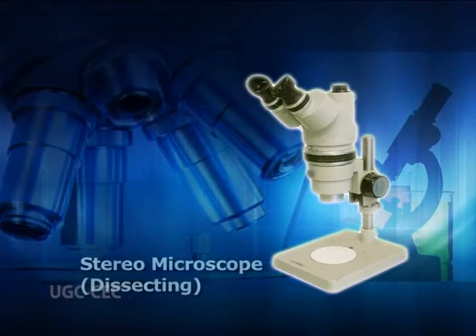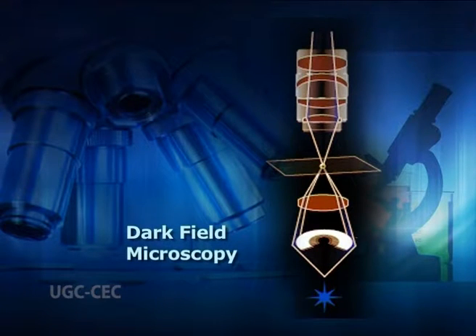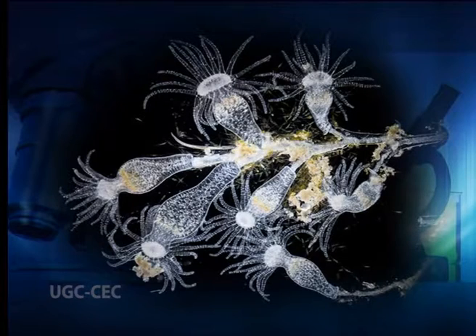Stereo dissecting microscopes are the types of microscopes used in anatomy and physiology for carrying out microsurgery, dissection, fine repair, sorting, as well as forensics. The advantage of the dissecting microscope is that it can be used on living specimens, but it has a low magnification power. Dark field microscopy. In dark field microscopy, the field of view is dark and the organisms are illuminated.